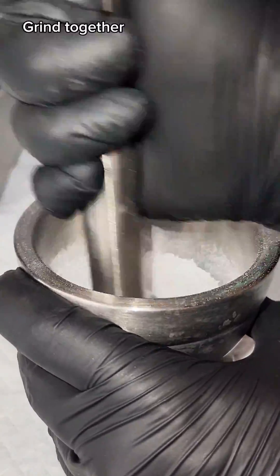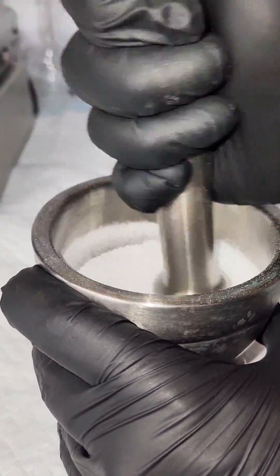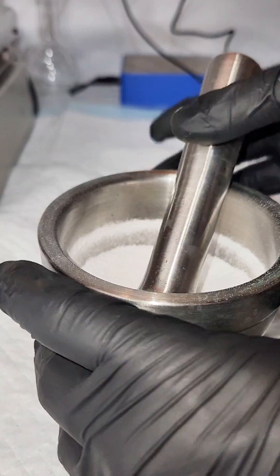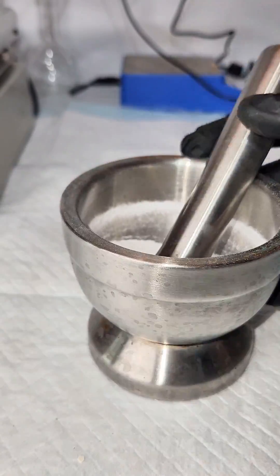Making phthalamide is pretty easy. To get started, all I do is grind together 10 grams of phthalic anhydride and 2 grams of urea in a mortar and pestle.